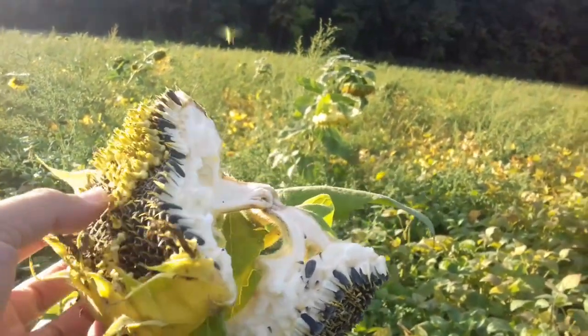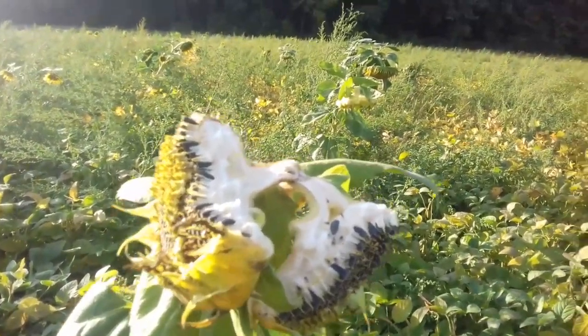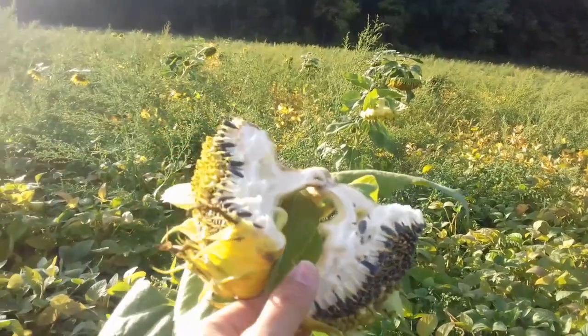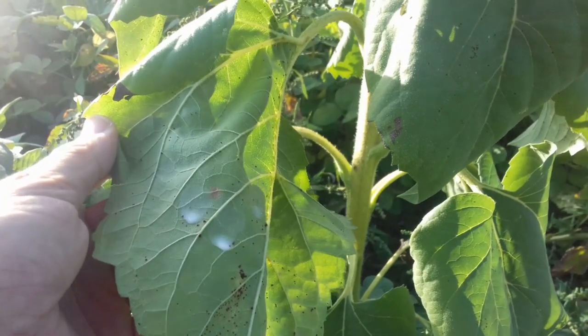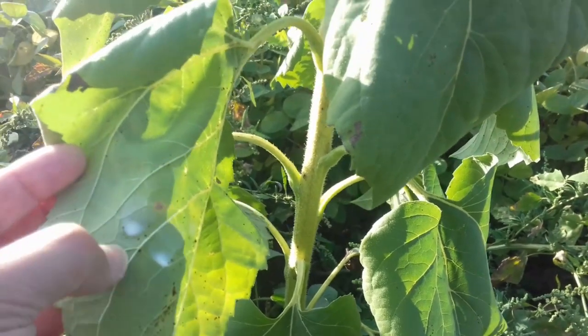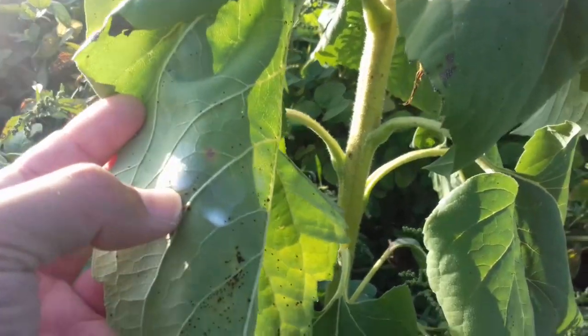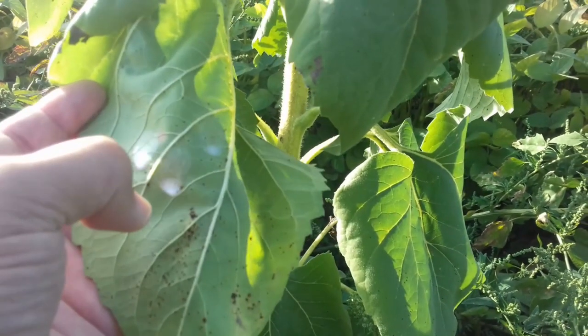Four hours have passed and I'm back at the sunflower — I cannot believe what I see here. Look at this — the flower has been broken, I don't know if somebody broke it. In any case, this is where the glue is. It's not completely dry yet — it's still white here — but you can see the rest is transparent, so it's almost completely dried.